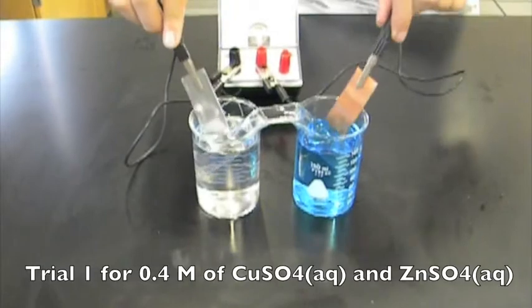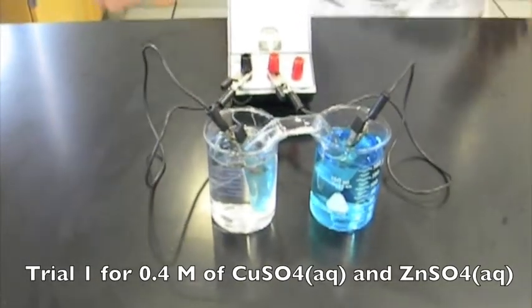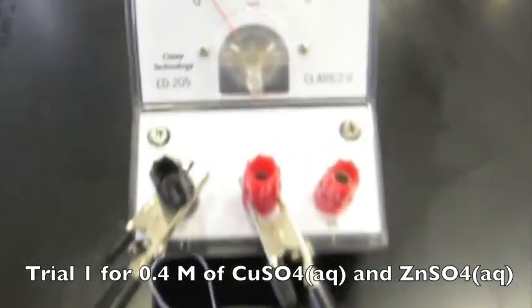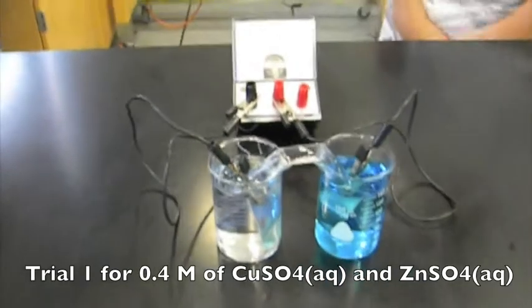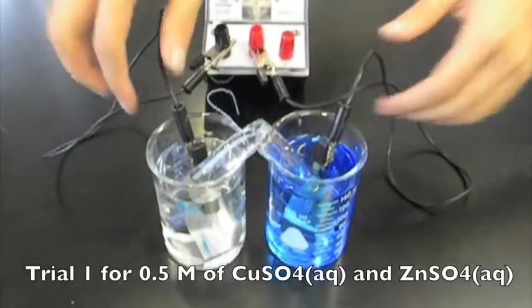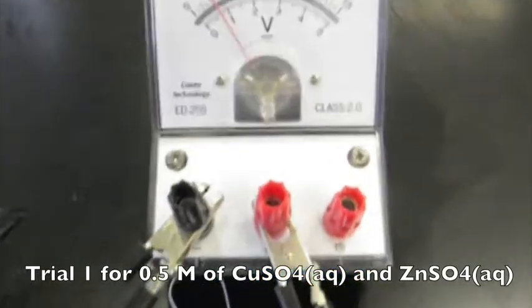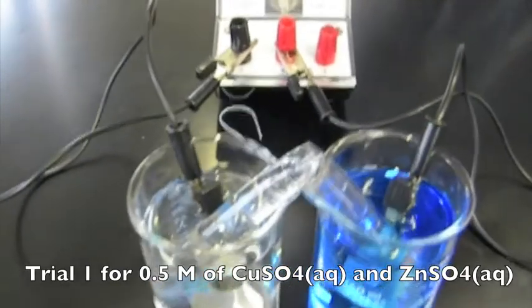This is the first trial of the galvanic cell that used 0.4 molarity of copper sulfate solution and 0.4 molarity of zinc sulfate solution. Here is the first trial of the galvanic cell that used 0.5 molarity of copper sulfate solution and 0.5 molarity of zinc sulfate solution.